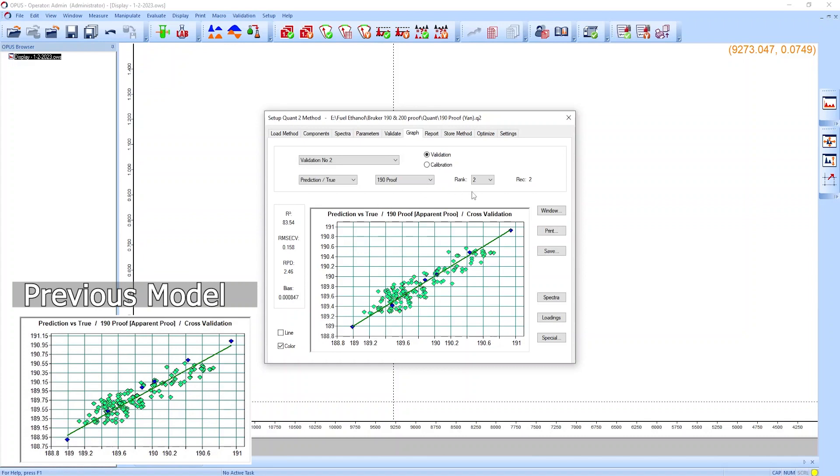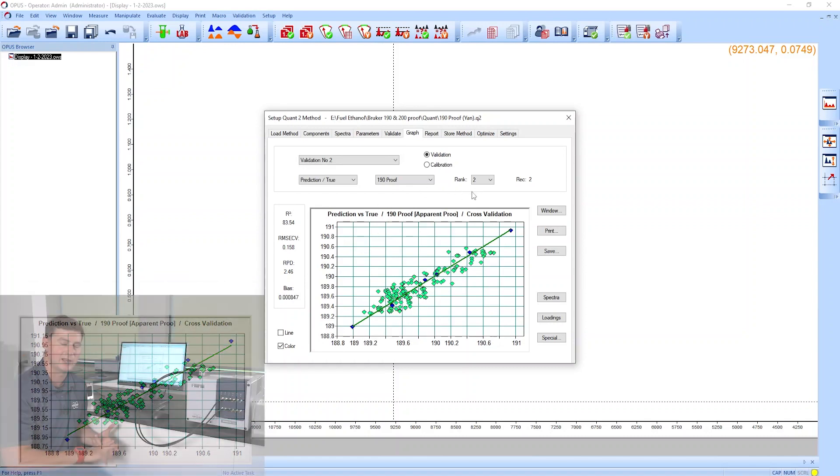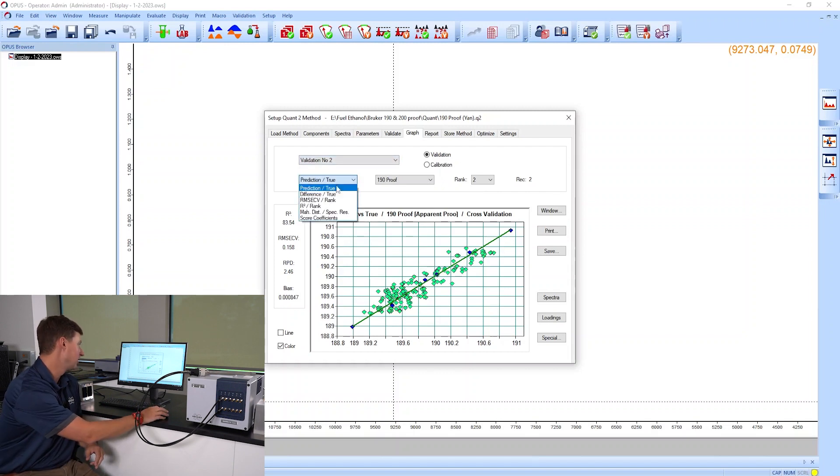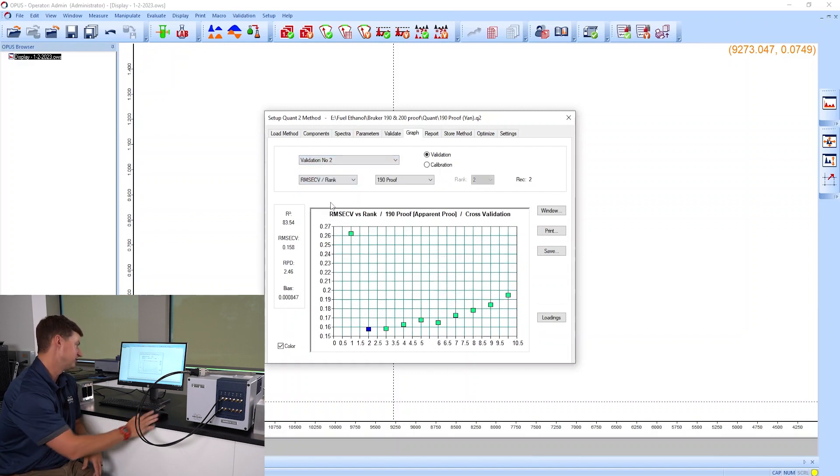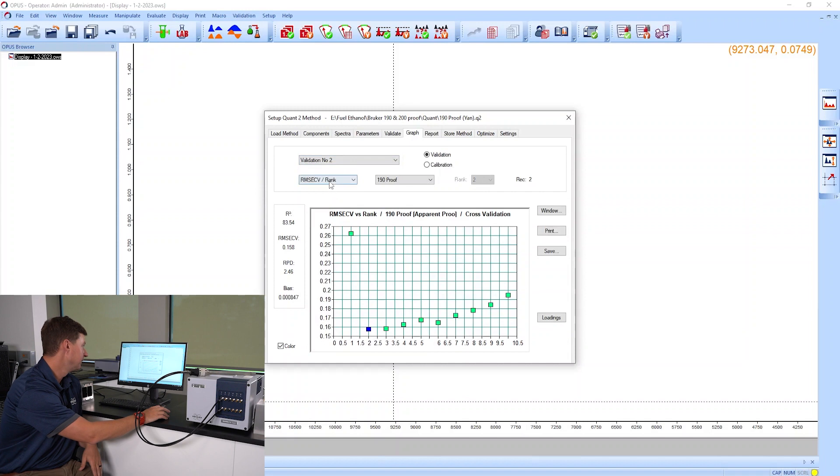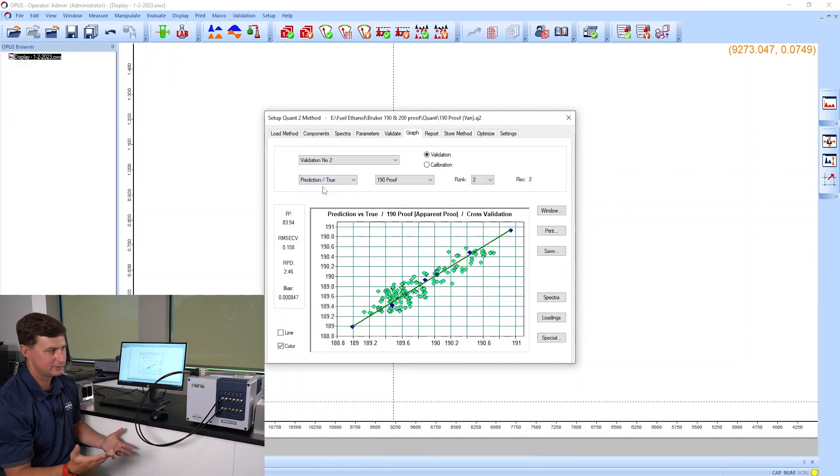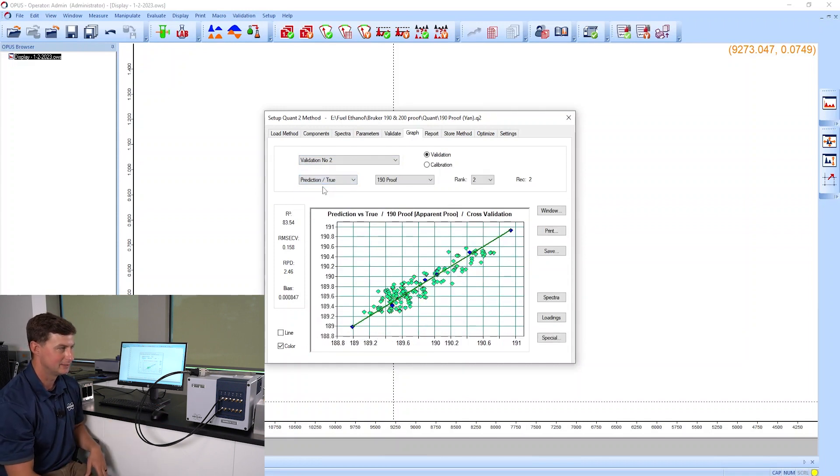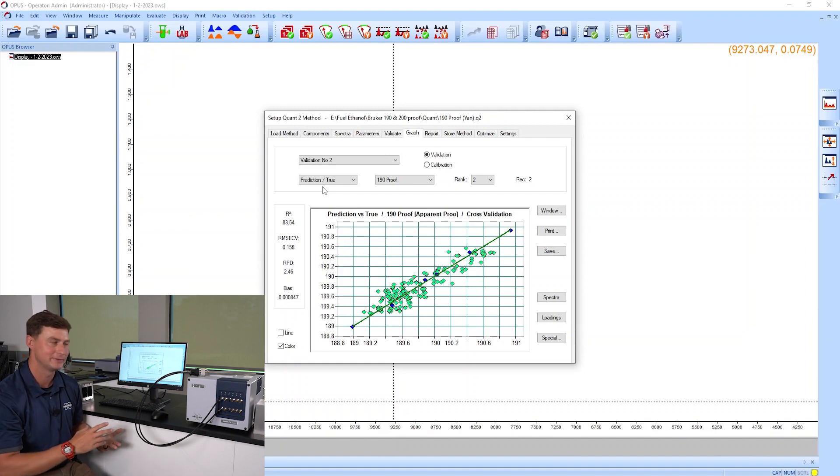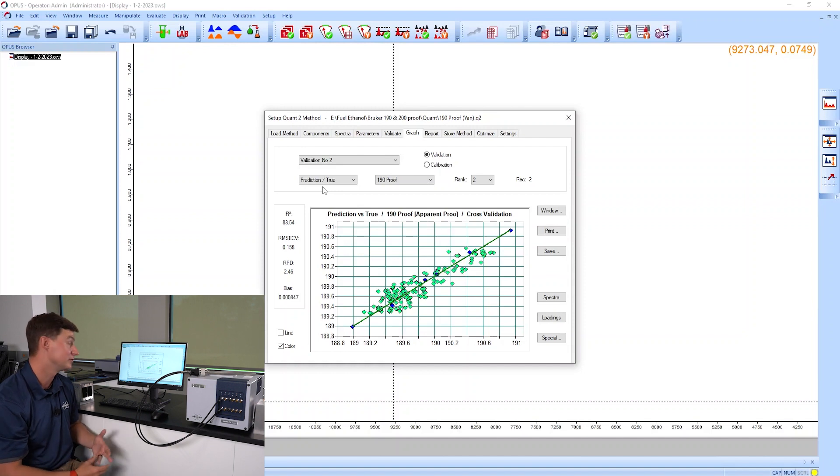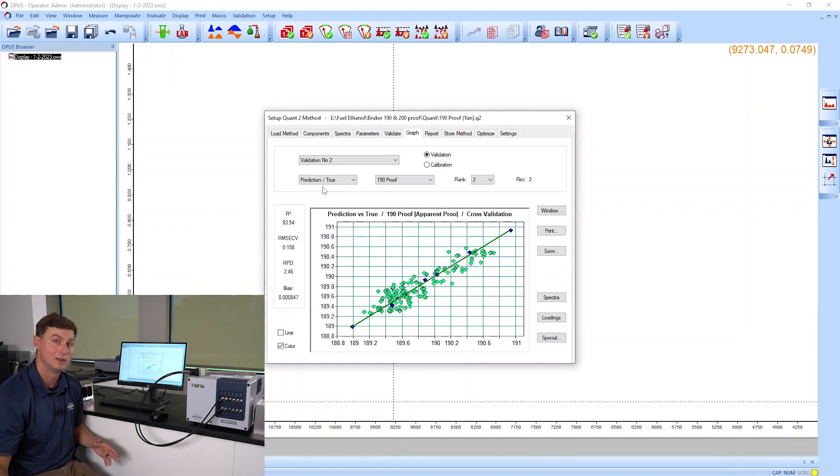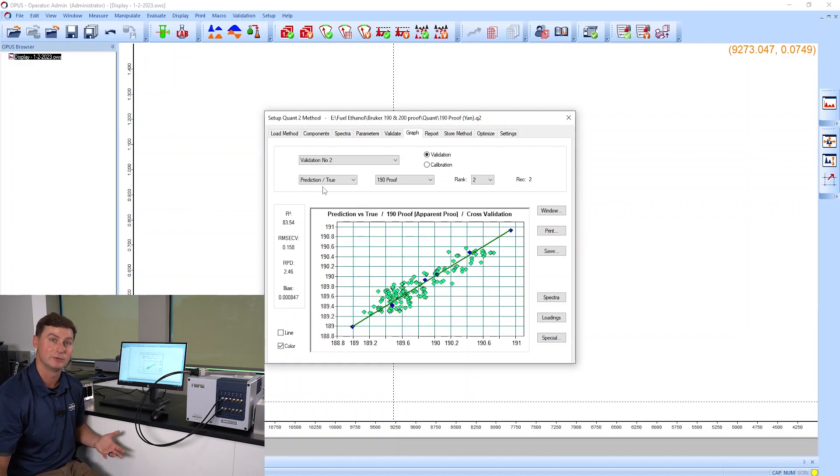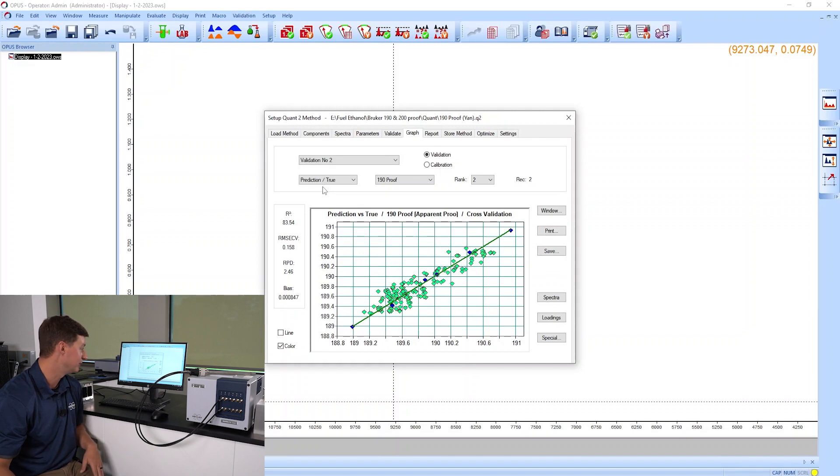We just want to make sure that we're not overfitting this. Make sure that your number of factors is appropriate, make sure your error versus rank plot is appropriate. Essentially we're dealing with a two-factor system—there's water and there's ethanol—and there's not a whole lot else in there. So you really should not have a large number of factors in this model. If you did have that, that would tell me that we're running the risk of overfitting this model, so we want to avoid that as much as possible.